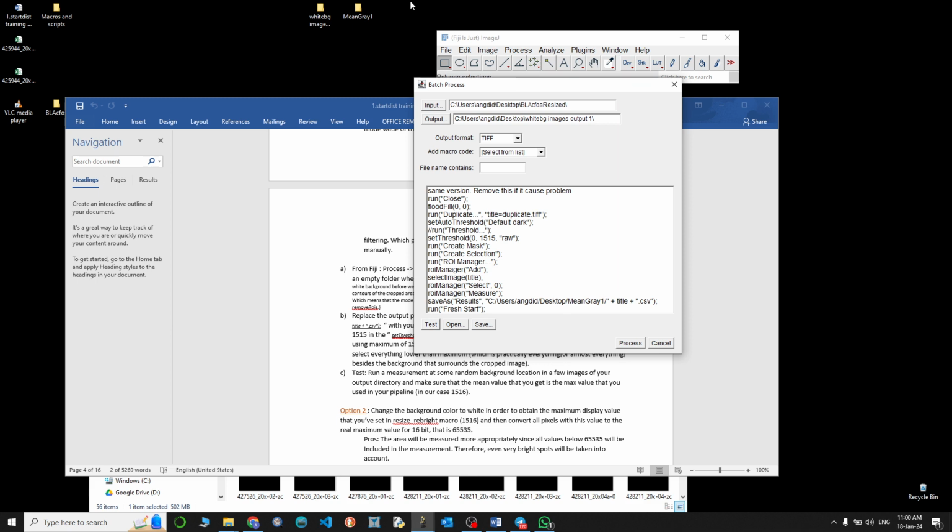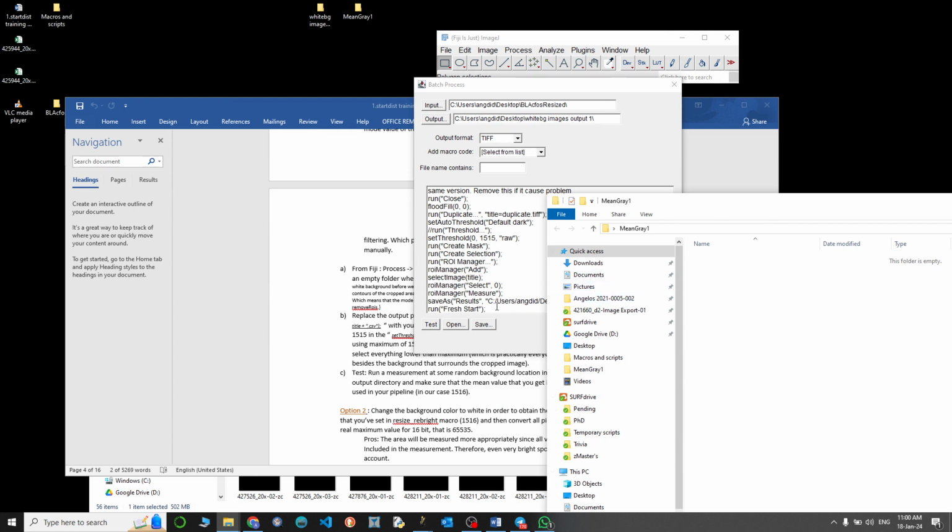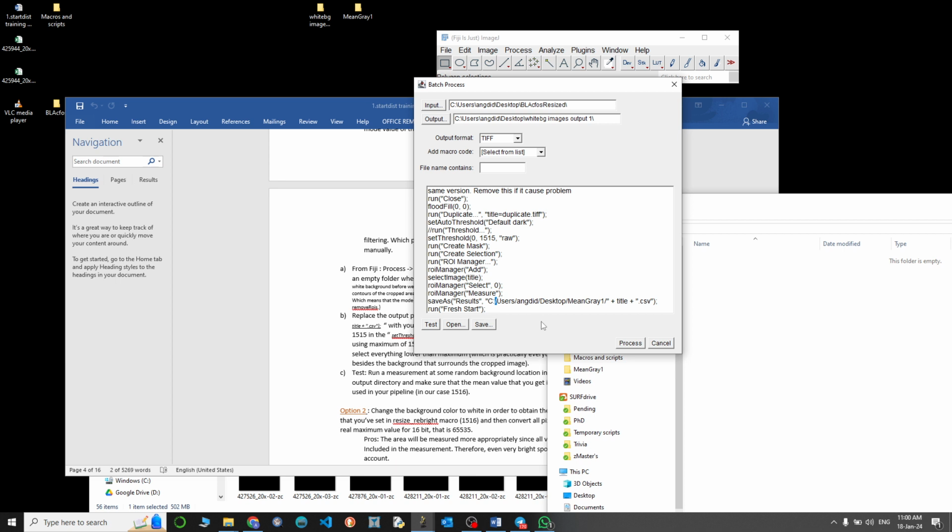In case you want to put your whole path there, be aware of the slashes and their positioning, because these ones look to the left or start from the left, and these are vice versa. These are reversed. So keep that in mind. It has to be like that, at least for Windows. I cannot guarantee for Mac.